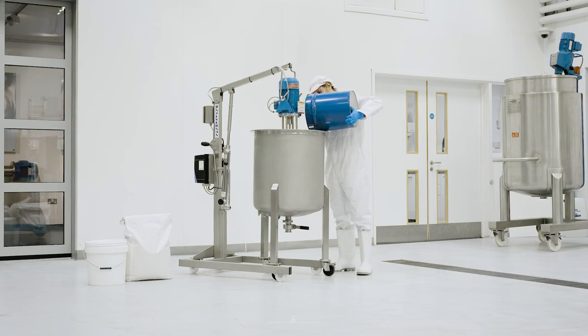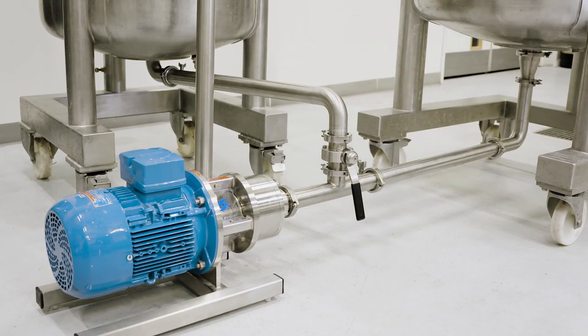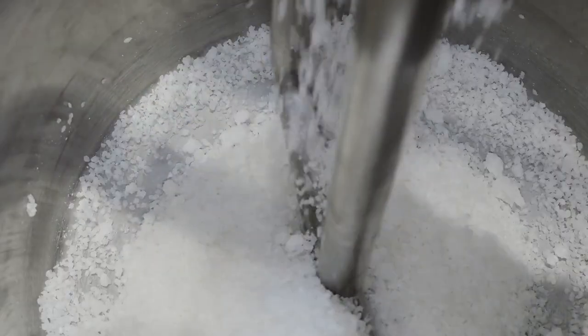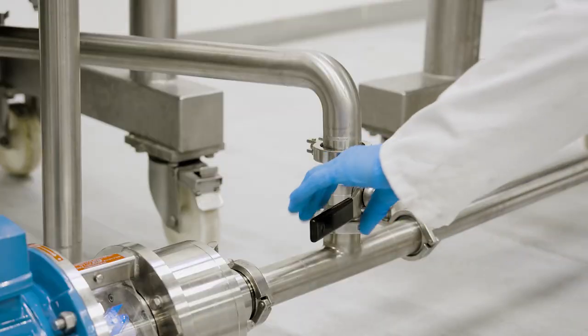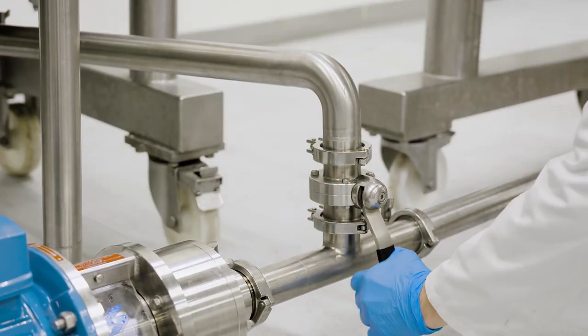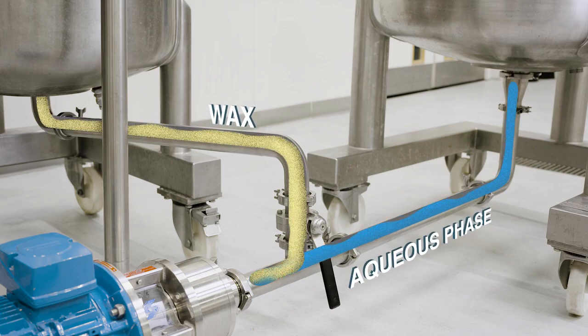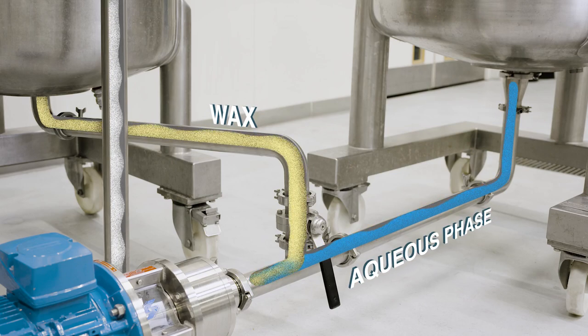This can be done in the vessel or with larger batches using an inline Silverson high shear mixer. Here the wax would be introduced to the recirculating aqueous phase via a manifold just prior to the inline mixer, so the two phases are immediately subjected to intense high shear action within the rotor stator workhead.